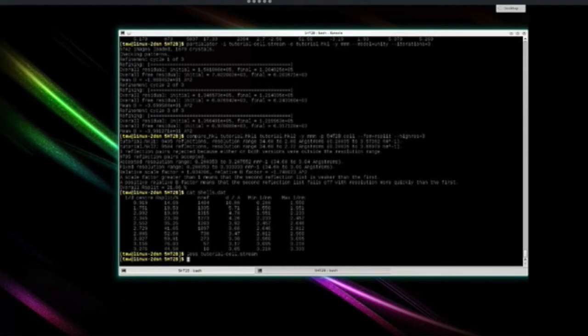We had another question, and I had a question. Someone asked if there's a tutorial for the geoptimizer. Presumably for a data collection run at a specific site, the geometry might be similar. Is that a shared resource, or does everyone refine and optimize it independently? Yeah, for the geoptimizer, we have a full tutorial on going from nothing to refined geometry that's on its way, but it's not up yet.